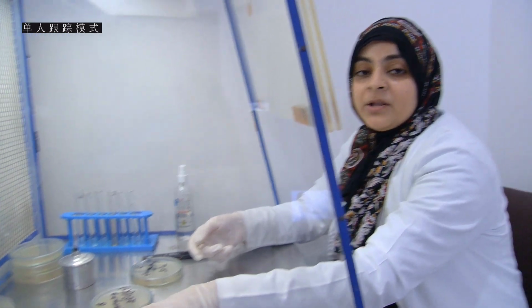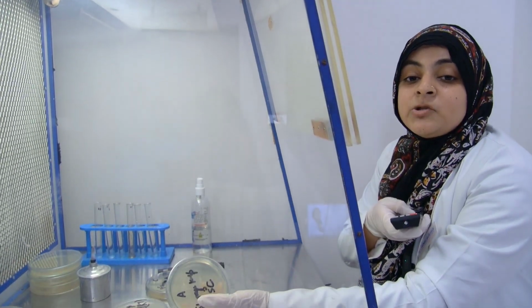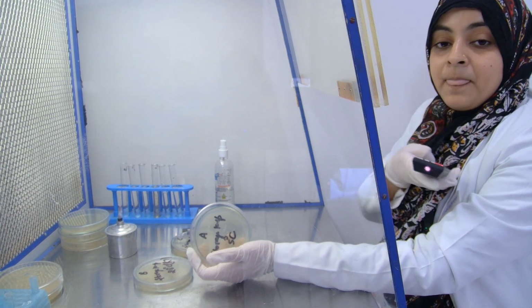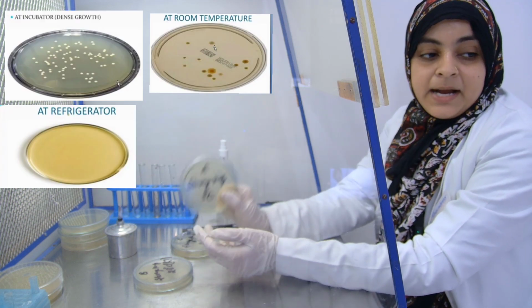Now if we talk about the first plate, this first plate which we put at 5 degrees Celsius, it means that there is no growth of the microorganism, because we kept it at 5 degrees Celsius, that is refrigerated condition.